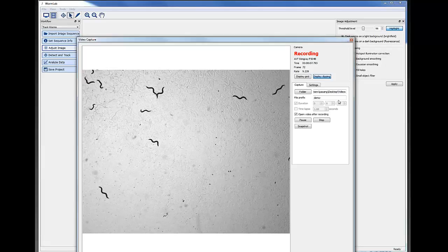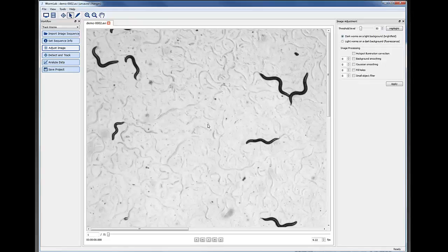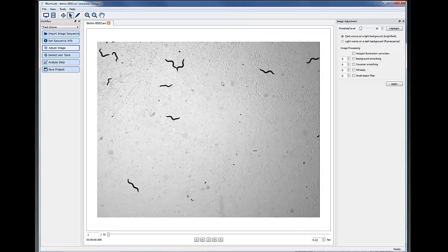And we're just about done. Okay, and then we're back in live view, and you can start seeing the tracks here, but that doesn't really matter. Now, I recorded this at quite a high resolution, okay? In other words, it's still the 5 megapixel, but you don't really need to do that.